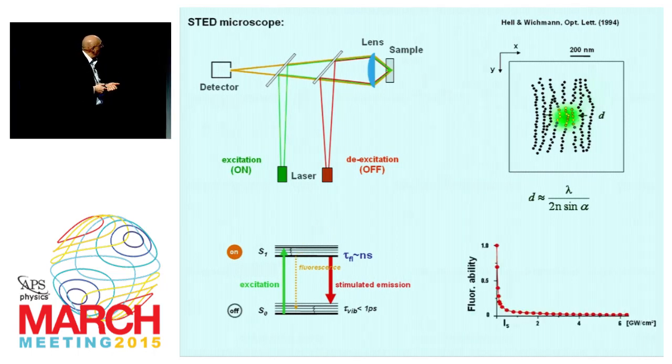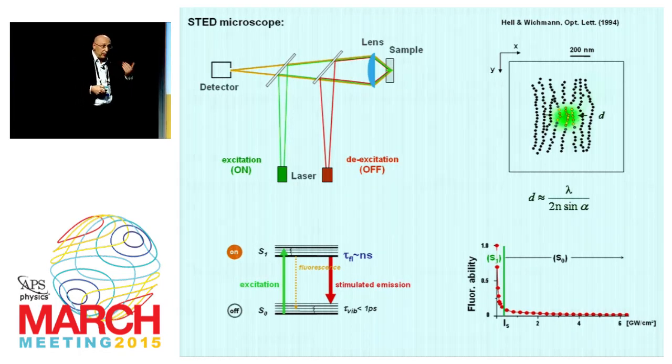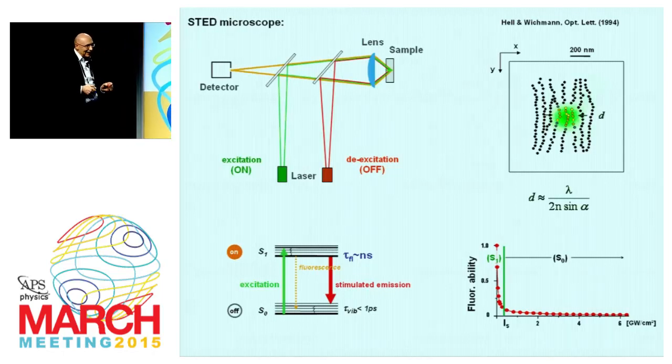And then, of course, we have to have a certain intensity. We have to make sure that there is a red photon at the molecule in case the molecule gets excited. So in other words, there's a finite probability of interaction, a finite cross-section, but if you apply a beam of light that is strong enough, and this is the intensity of the red beam, so that there is always a photon present at the excited molecule, you can be sure that the molecule instantly returns to the ground state as soon as it gets excited. So for a certain intensity of the red beam, you have turned the ability of the molecule to occupy the excited state off.